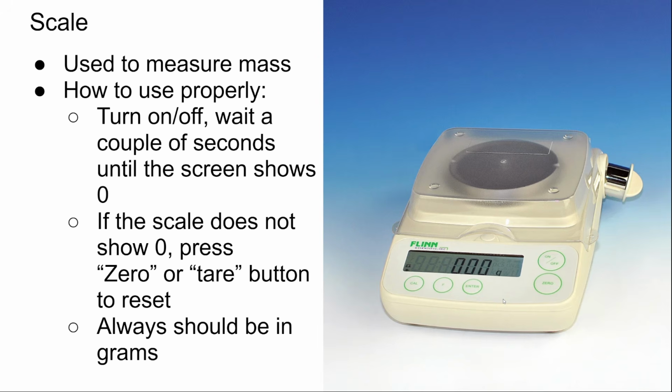And so those are the different types of equipment and glassware that we use. Hopefully throughout this year, you get familiar with those pieces of equipment, what they're good at and what they're not so good at, so that as you go throughout the year, you are familiar with the equipment that we use.